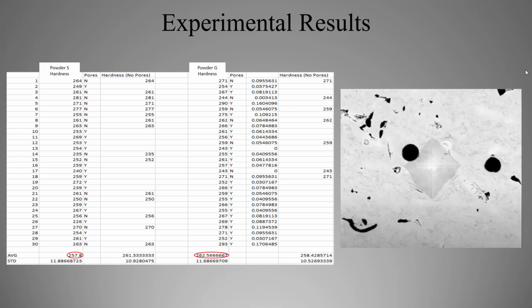As we can see in the image, the indentation is a diamond. The big black spot is actually the tungsten chromium carbide alloy, which is added knowingly to the coating material and is said to improve the hardness of the coating.